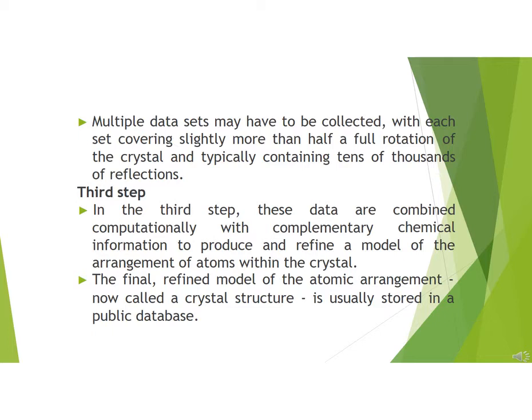Now the third step. The third step is the most important step of single crystal X-ray diffraction, because in this step the data obtained through the electron density map is computationally combined with the complementary chemical information stored in our database to produce and refine a model of the arrangement of atoms within the crystal. The refined model of atomic arrangement is known as the crystal structure, which will be recorded in a public database for future use.